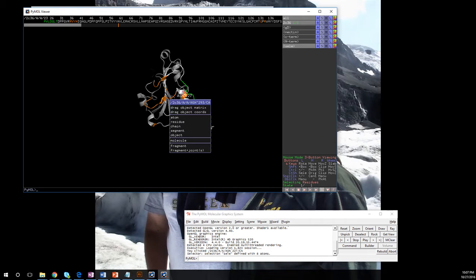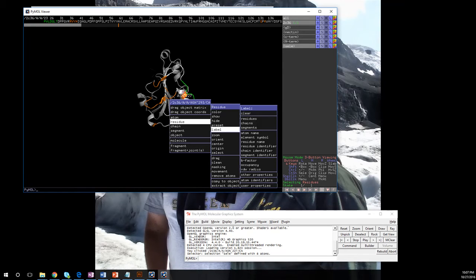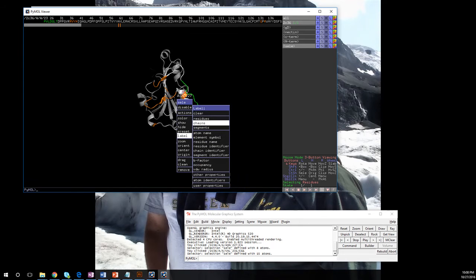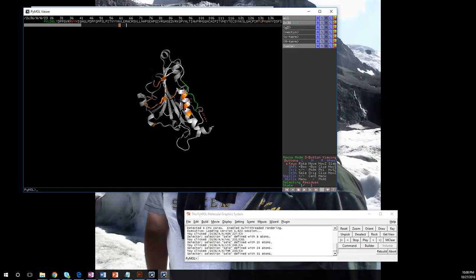So you really don't want to be doing that. Oh, I must have missed that label. Okay. Oop, I got rid of both of them.